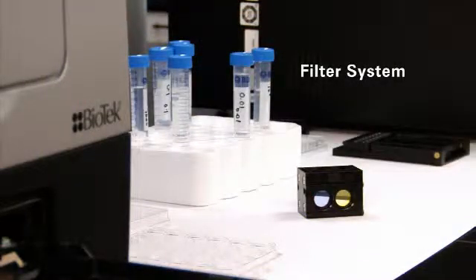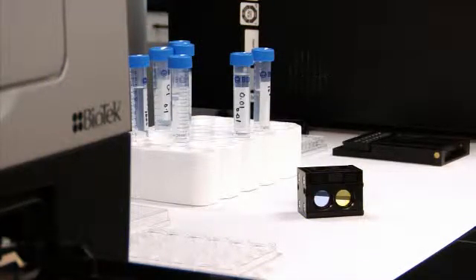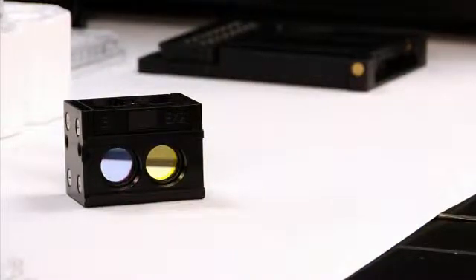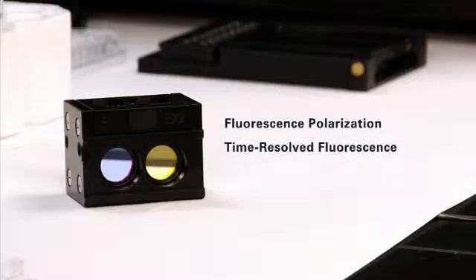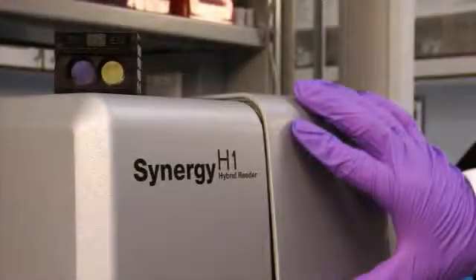The filter system is available as a separate module and can be added as an upgrade. This module supports advanced read modes such as fluorescence polarization, time-resolved fluorescence and TR-FRET, and turns the Synergy H1 into an advanced hybrid microplate reader.